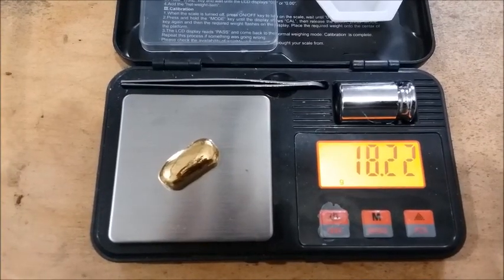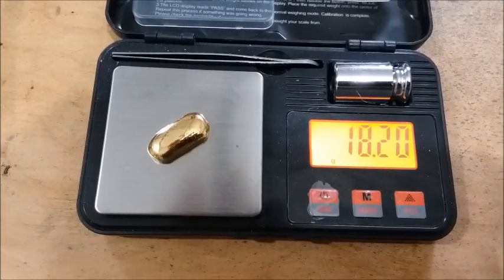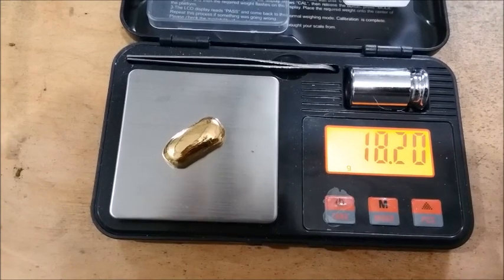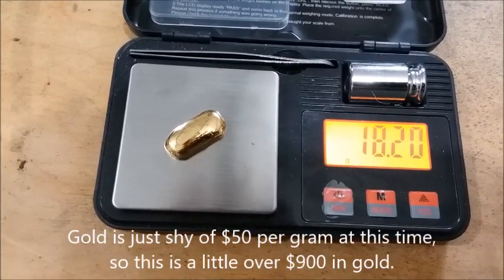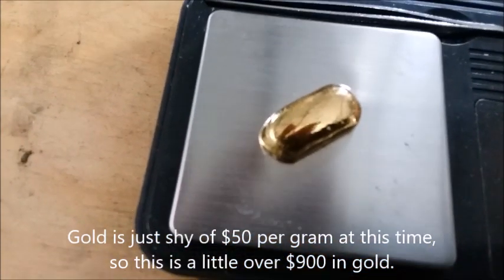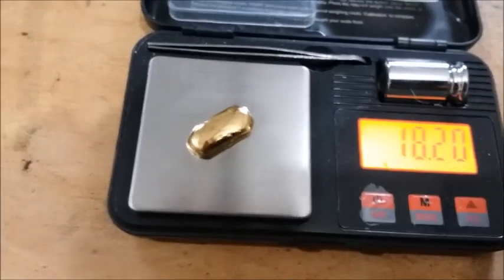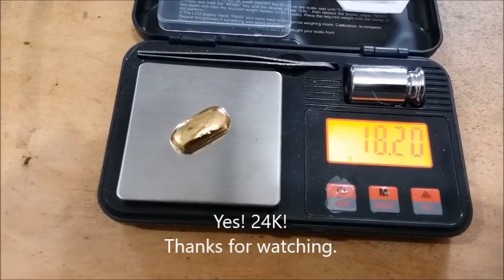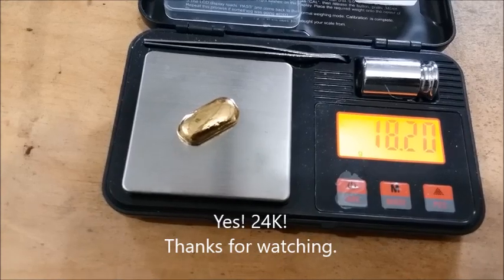There it is on the scale. It's a tiny bit lighter than the powder I started out with — the powder may have been still slightly damp, so it may have been a little bit heavier than I thought with the water weight. But still, it's over 18 grams and it looks just absolutely gorgeous. I don't know how well it's showing up on the video, but now it's off to the jewelry store and they can tell me what the purity is and what they're willing to pay me for it.